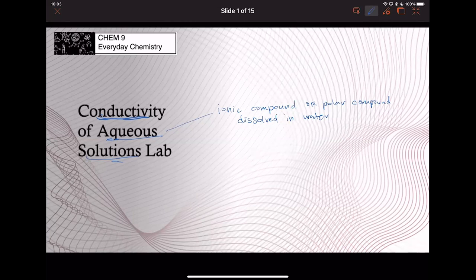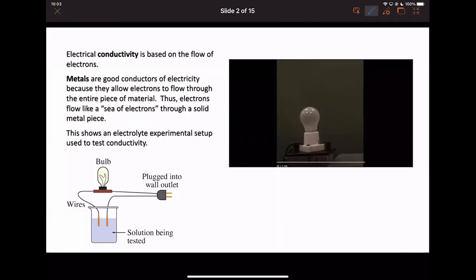So you've got video experiments today, as well as understanding the molecular views. What's going on at the molecular level for an aqueous solution? That's something dissolved in water. So this is a review of what we've covered in Module 8 for the process of dissolving, when water does its thing, basically. So when we're talking about this conductivity apparatus, I've got two versions of it here.